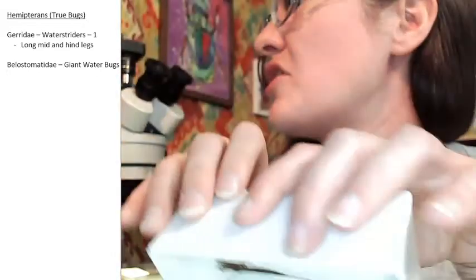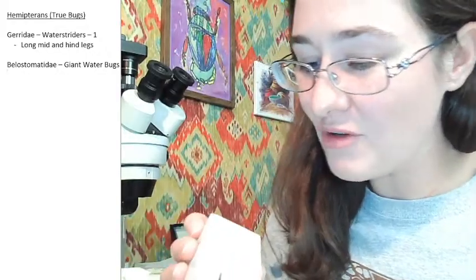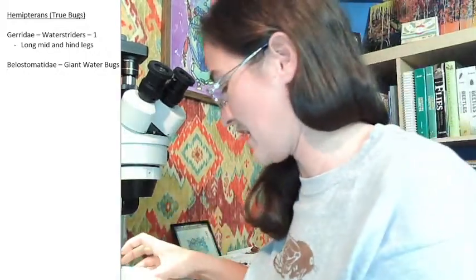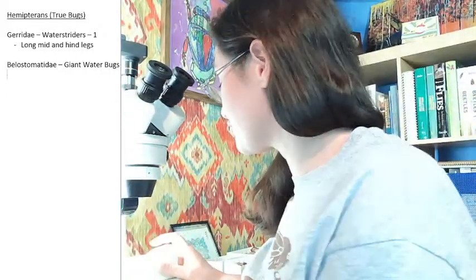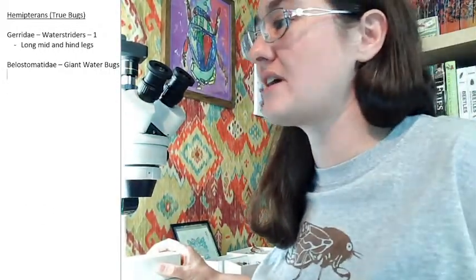Get a little bit more light on him. No! He's going to have to go under my microscope. This is going to be a water scorpion. Alright, so water scorpions are considered true bugs. They've got those piercing and sucking mouth parts.